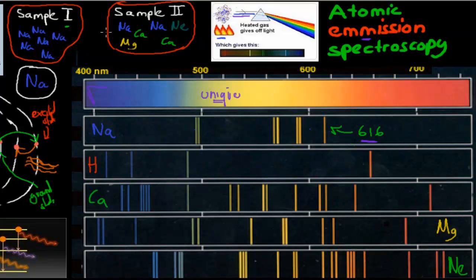So in this case, we have all different types. We're expecting it to emit all these different wavelengths of light, and we can see that when it comes to the prism, right? It'll hit the prism, and then we can see what comes out on the other side. If it's all these different wavelengths, that means we've got these different types of elements present.